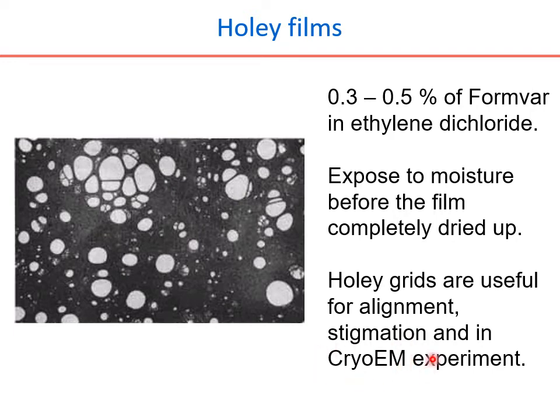The strength of cryo-EM is that the image of your protein or macromolecule is suspended in its own buffer environment. Here, if you look at the film, there is a hole. The hole means there is nothing here, and everywhere else there is the plastic. On top of the plastic, we coat with carbon. So we have a place here that looks like a well, and we have a place where there is a substrate available. Now if you send the protein, it has a chance of sticking onto the substrate here, and some of the protein is trapped in the well.